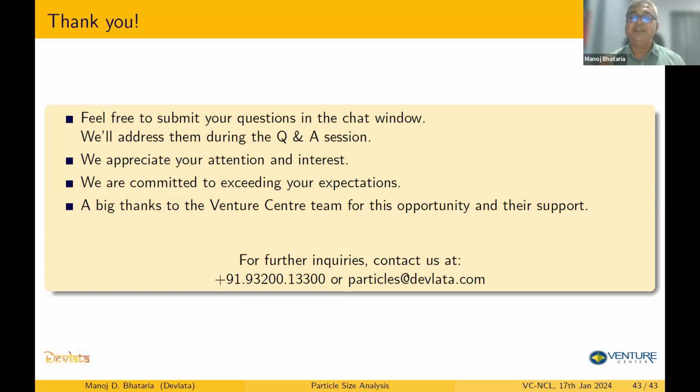So you need to eliminate the unwanted particles somehow, by using filtration or some other technique, so that those particles don't come in the path. The solvents that you use, the place where you measure or prepare the samples, the chambers and the vessels that you use, they need to be worked on a bit.